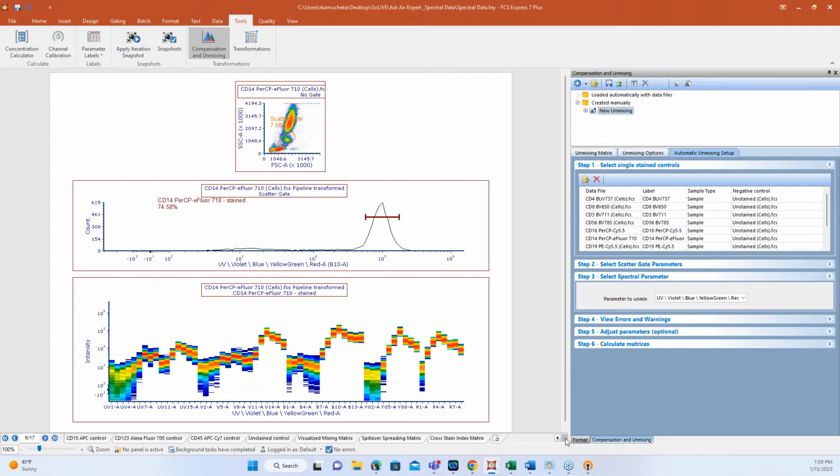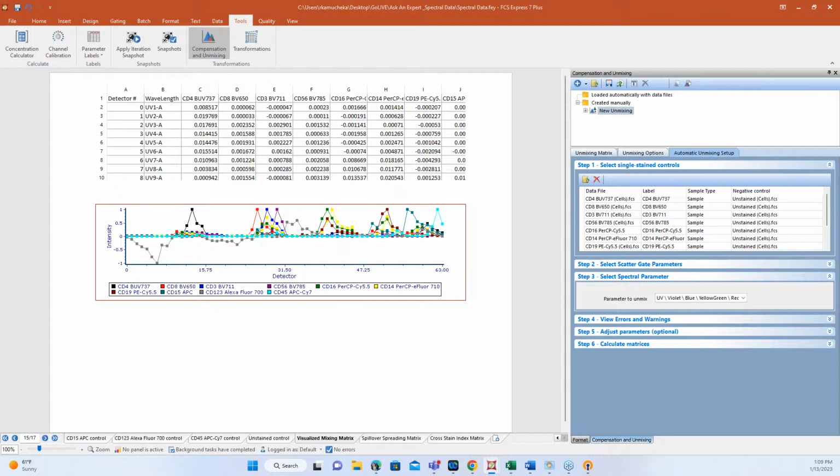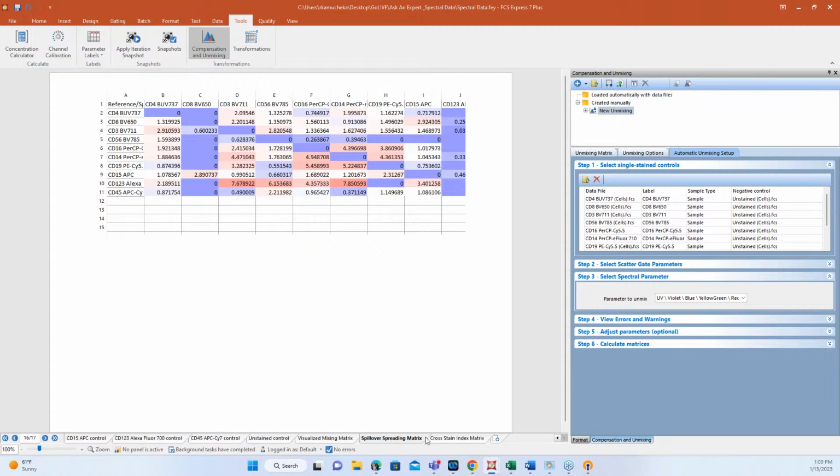One thing also that I really love that we have implemented in the software is when you do those unmixings and start generating this information, you get a visualized mixing matrix so you can see how things are getting separated and parsed out and pulled apart. You can see our spillover spreading matrix, right? So we know the influence from fluorochromes, and then we can see the cross stain. So it gives us a lot of information about our panel, how things are working, influencing one another, where we need caution, where things are working well. It gives you some ideas of how these fluors are behaving once they're in the same space.